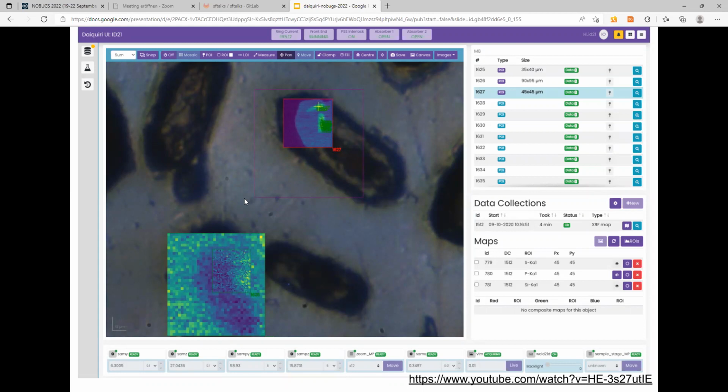Do you use Nexus or anything to determine what's in the HDF5 file? My DAU colleagues would know more about that. Someone like that would know what actually goes in the HDF5 file.